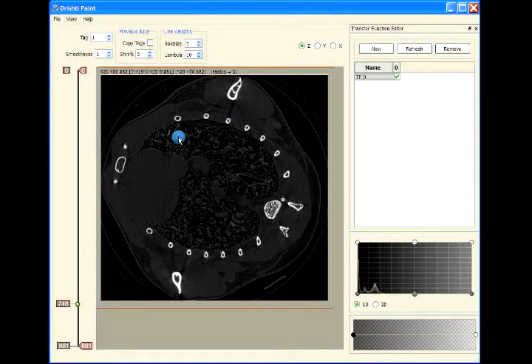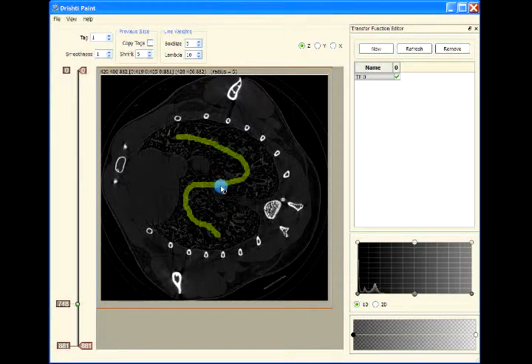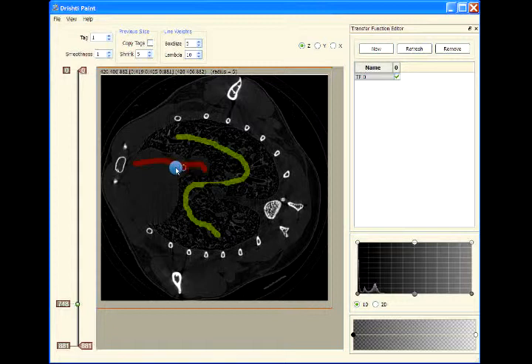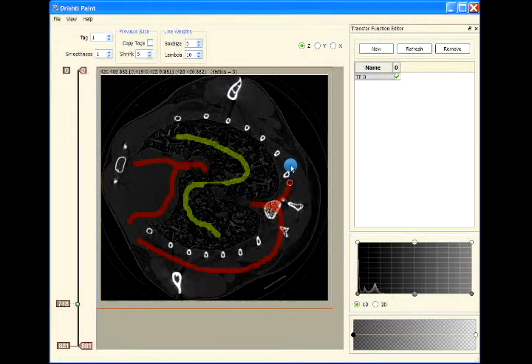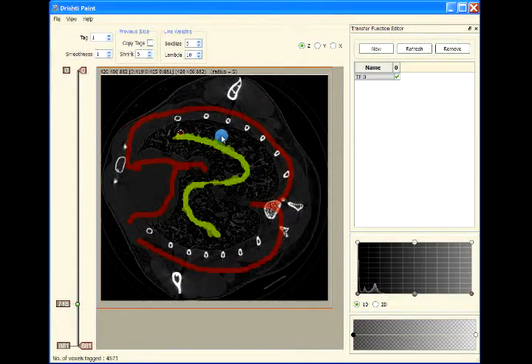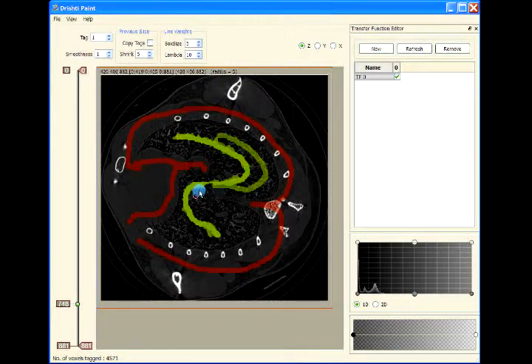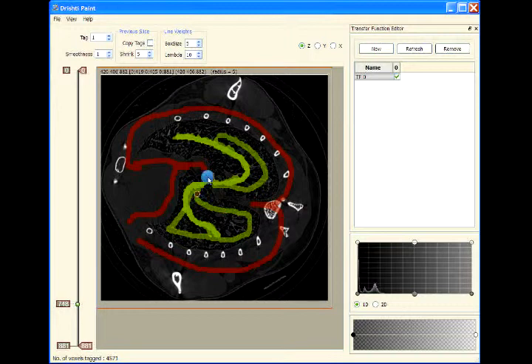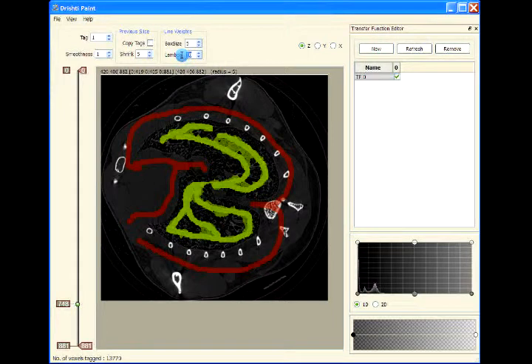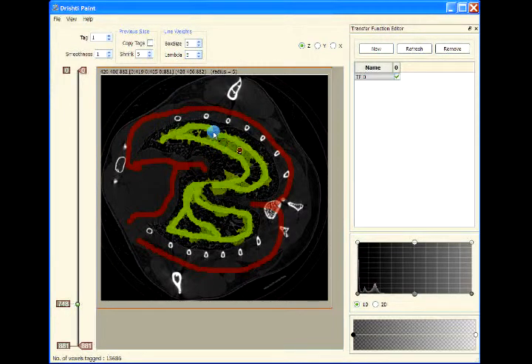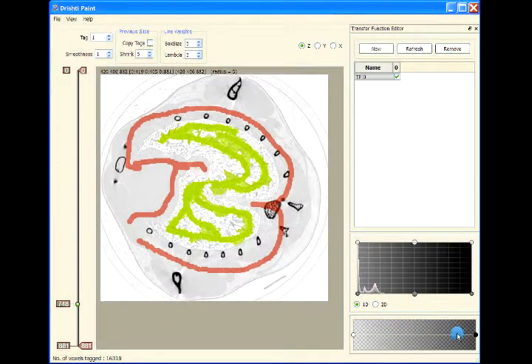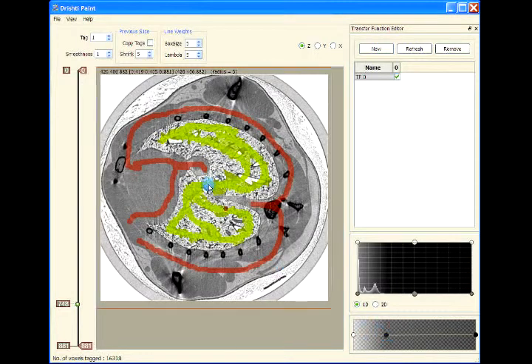You can start tagging here. This is the object and this is the boundary, the background region. So press tag. As you can see, because there is a lot of noise here, we might have to play with the lambda or we can flip this and then increase the contrast.